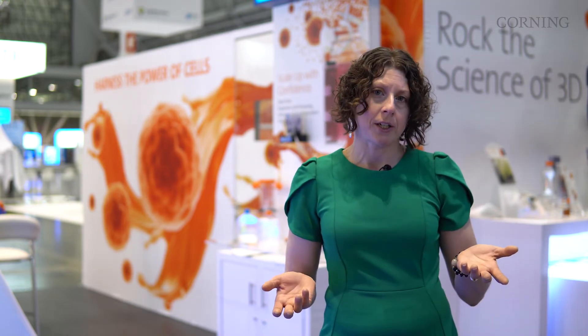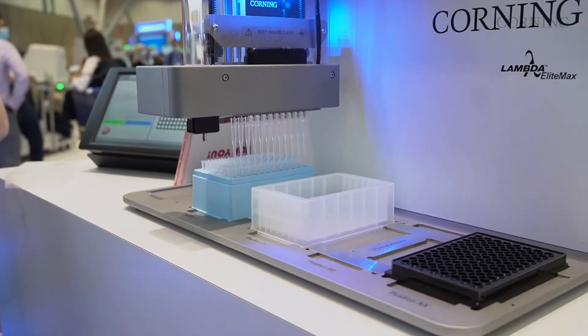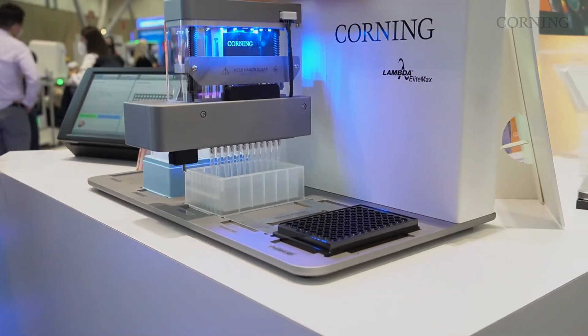It has five deck positions for all kinds of workflows, and it uses disposable pipette tips for maintaining sterility and ease of use. For more information, ask for a demo.